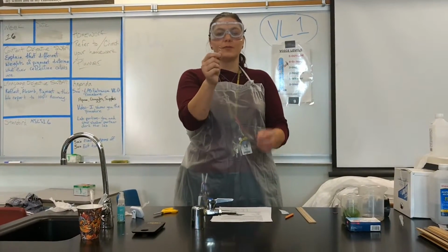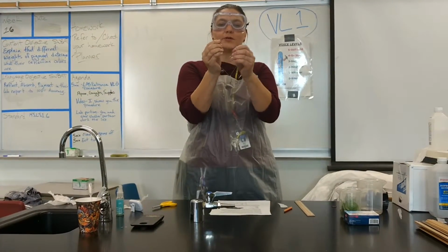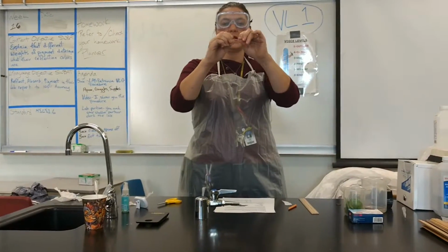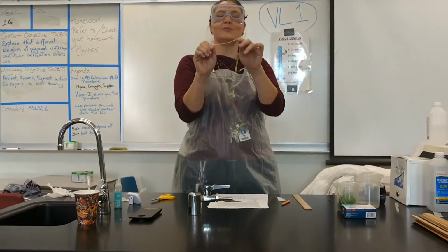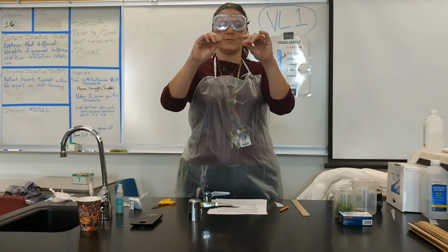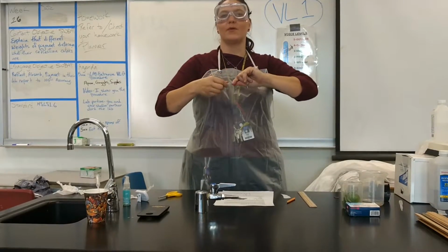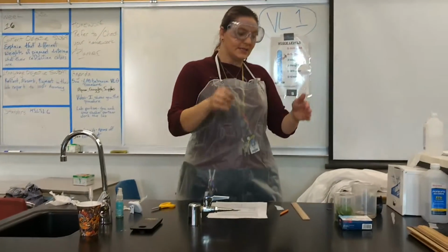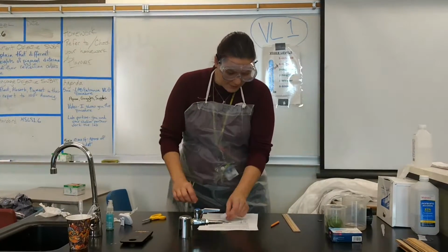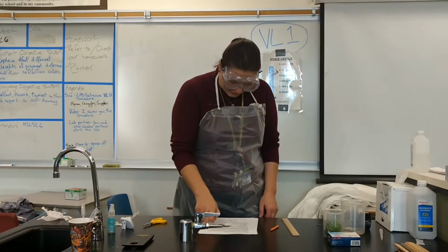Now I'm going to go ahead and take my pieces and my paper clip. Every shoulder pair is going to be supplied with a paper clip. I have my paper clip here. I'm going to unfold the paper clip and do my best to make it straight. Yes, I am allowing you to unfold a paper clip. This is very important that you have it straight. Do your best not to twist your tines, because this is what's going to keep your chromatography paper sitting on top of its beaker. So I have my paper, my paper clip, thank you very much.